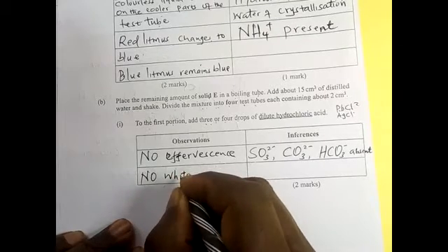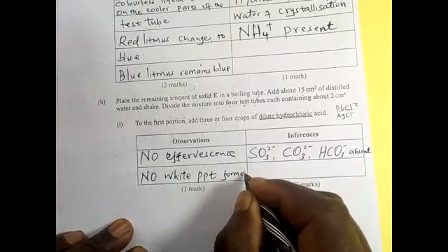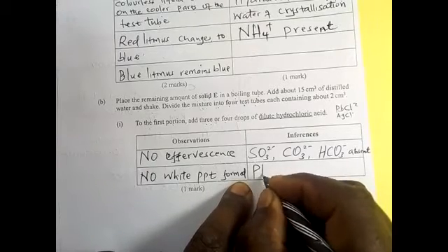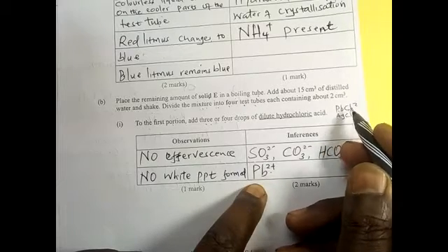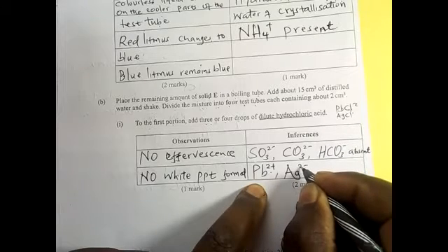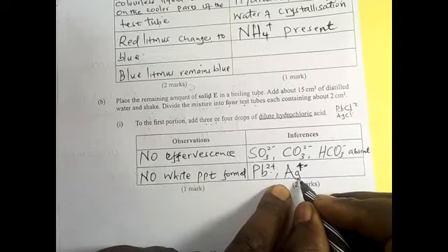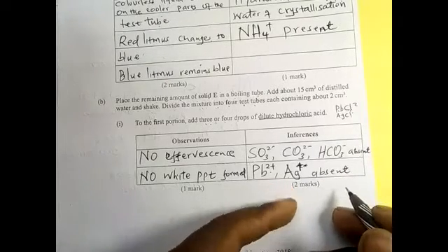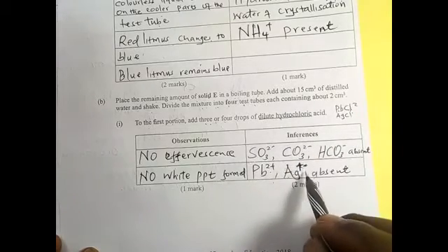Another observation is that there is no white PPT formed. If there is no white PPT formed, then it means that inside there was no lead. We expect a white precipitate with lead chloride, or silver. Silver is positive 1. Silver were absent. These two ions were absent because they form a white precipitate with a chloride ion, so they were absent.